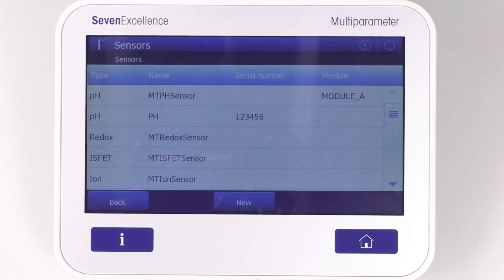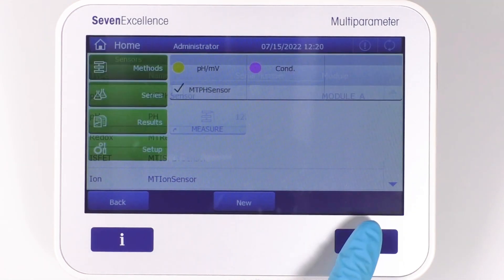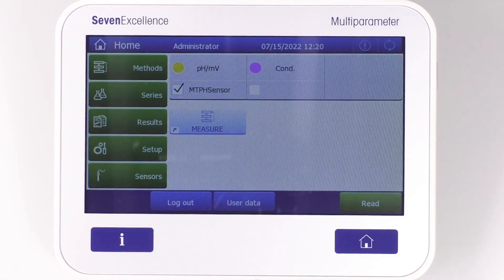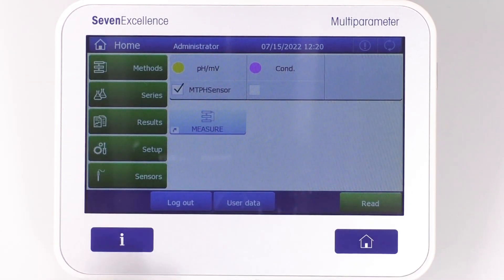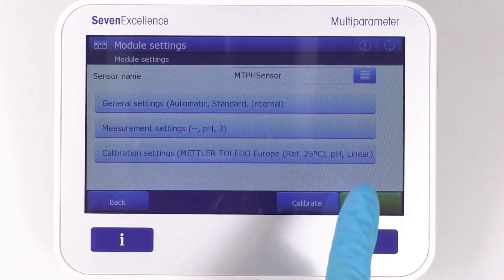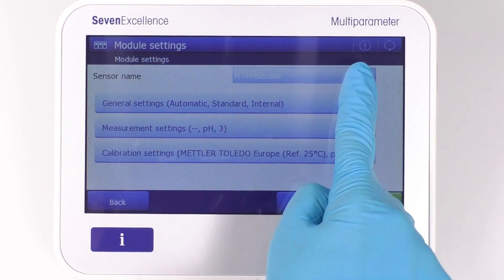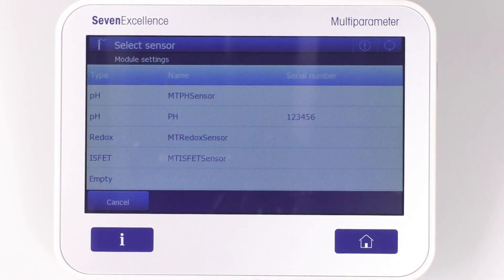Once you've done this, you can easily assign the sensor to the module by returning to the main screen. Select the desired module, and then choose the sensor from the list under its name.